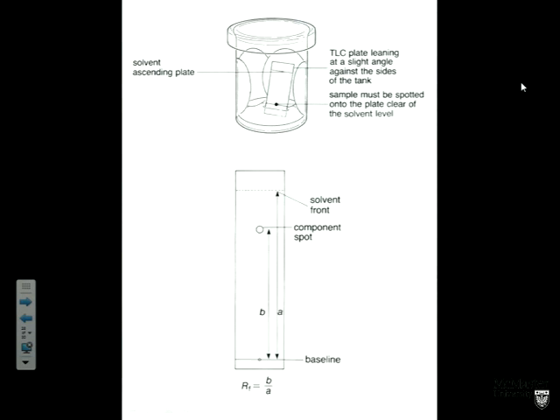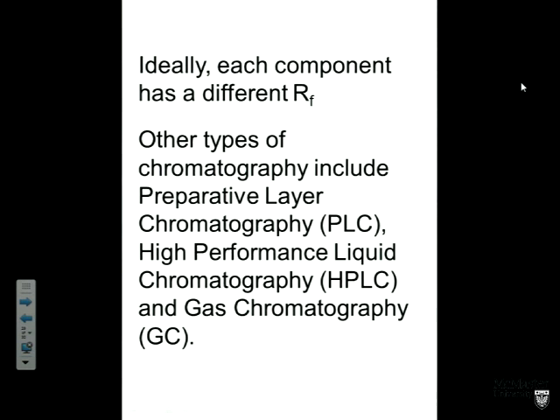If both spots move to the same distance, are they the same compound? Yeah. It's not bad evidence. Would you go to court with that if you wanted to prove that it was cocaine? No. I don't think any judge would accept the fact that one TLC plate with two compounds traveling the same distance proves that they're the same molecule. But it is some good evidence. And as we'll see on Thursday, all of spectroscopy is about building bits of evidence rather than having one simple proof. So ideally, each component has a different RF and travels a different distance up the plate.